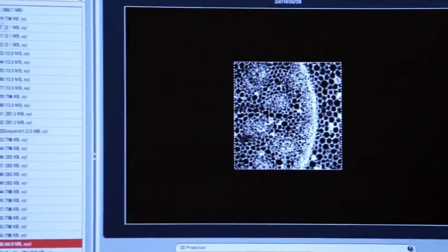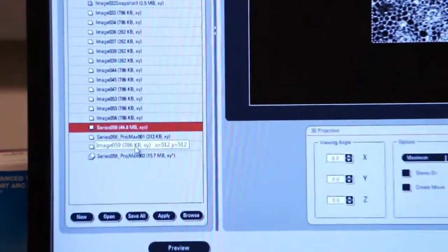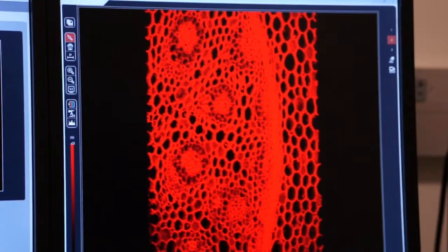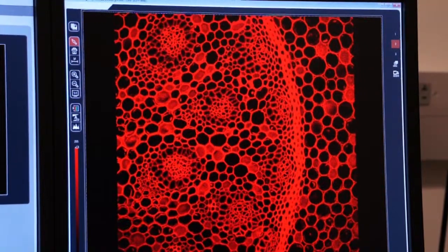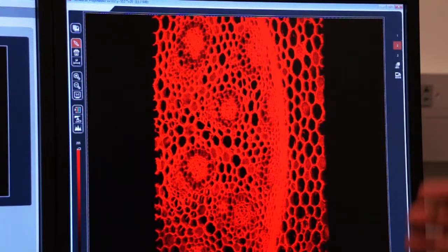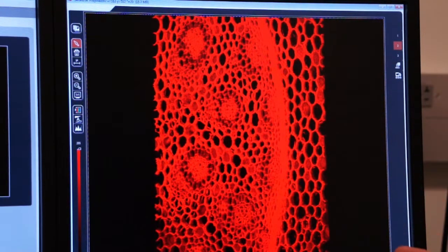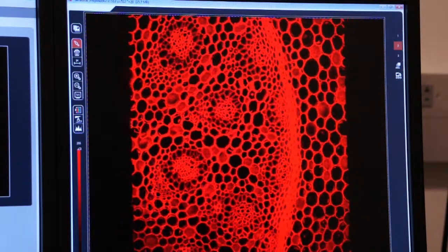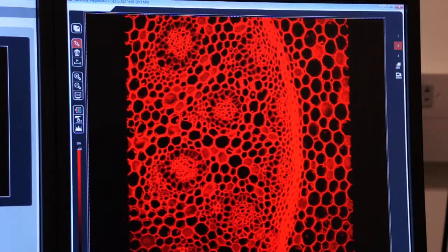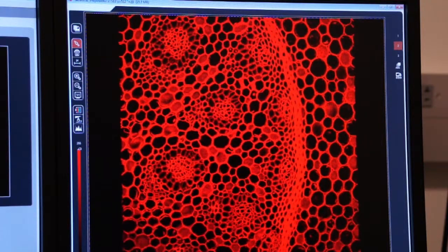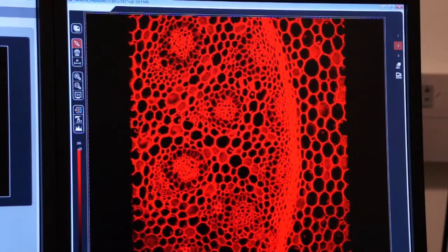But I've already made a movie of this which we'll project on the next screen. So I'm going to go to Experiments. I'm going to select the series that I used to make this movie. And now we're going to come over here to the right screen. And you will see a 3D movie that I can press Play on. And you can watch this rotate in 3D. Now if we had done, say, 150 separate images instead of only 57, you would see a deeper Z-Stack. But we can manipulate this again with the sliding bar. And now you can see the relationship between things that are in your specimen. So 3D movie, 3D maximum projection is a very important tool after you've completed a Z-Stack.